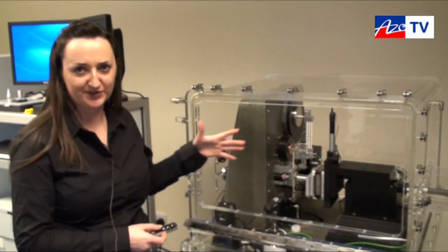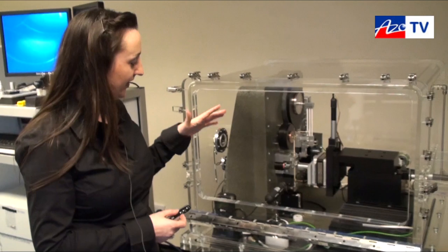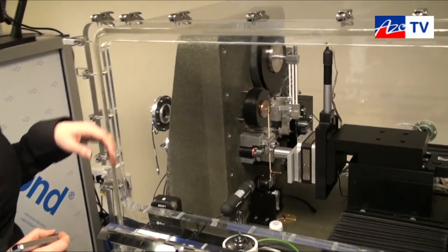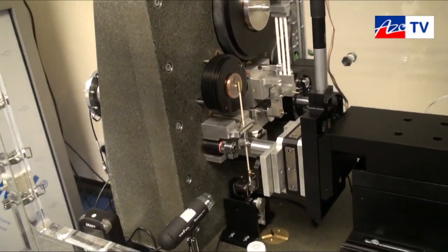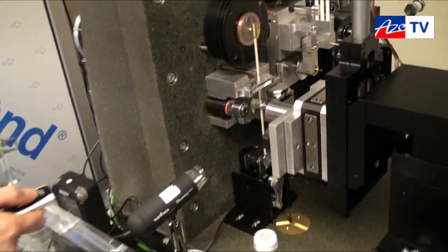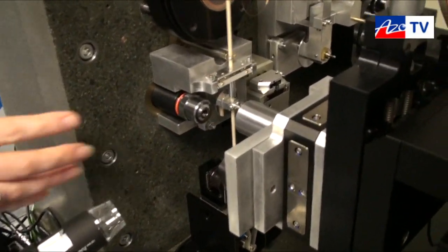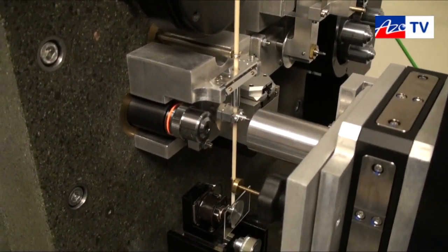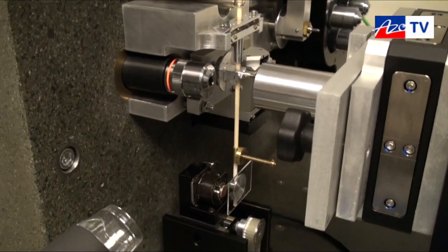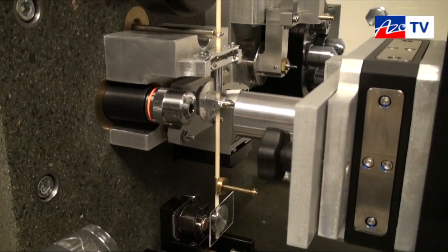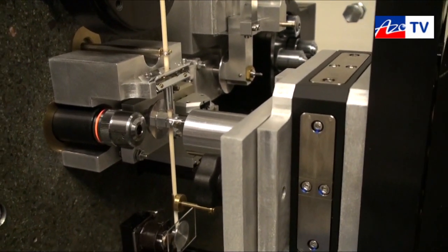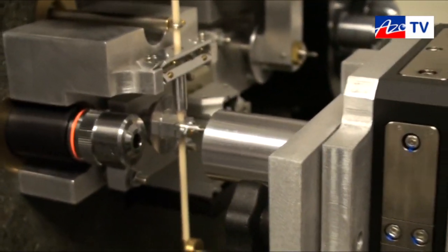Right, so we look at the different measurement stations now on the instrument. We have five separate positions that we can position the sample in front of on this instrument. So working from the front to the back, firstly here we have a small single objective microscope which works throughout the range of temperatures, from room temperature to our maximum operating temperature of 750 degrees. This allows you to visualize the sample and place your indents in a very targeted way.